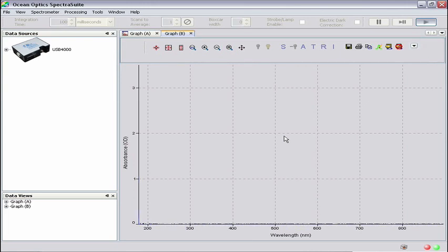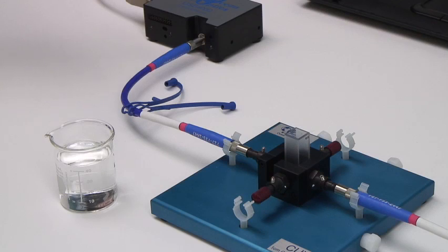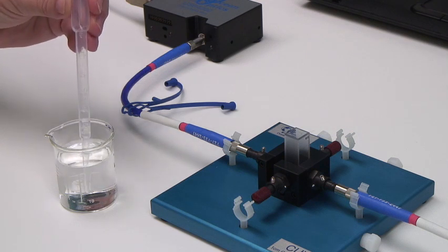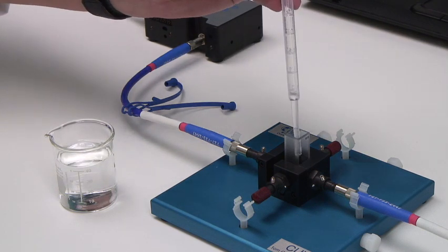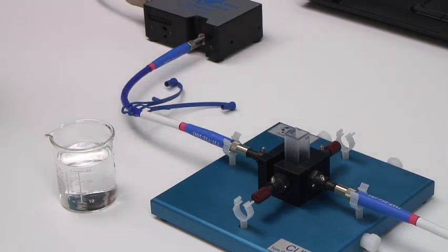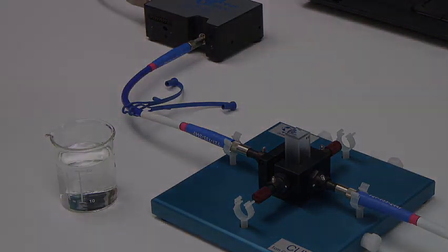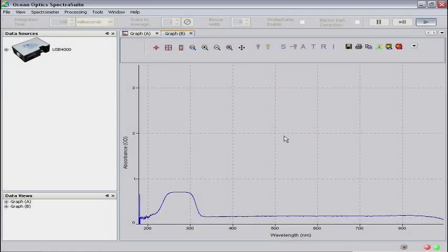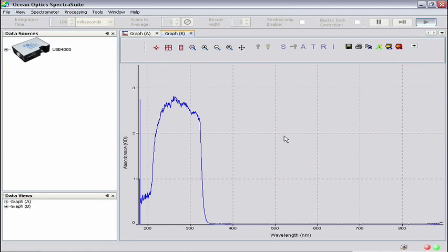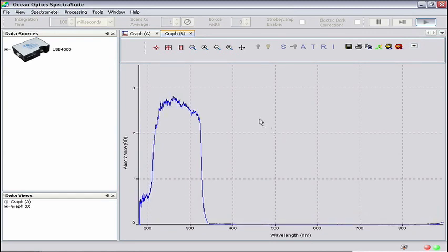It's time to prepare our acetone sample for measurement. Using a disposable pipette, we'll fill the blank cuvette with the acetone. We recommend that cuvettes always be used in the same orientation, and take care not to touch the cuvette's optical surfaces. Oils from your skin and other contaminants can affect absorbance readings. As the cuvette is filled, note the absorbance spectrum — it has spectral features comparable to a high-pass filter.